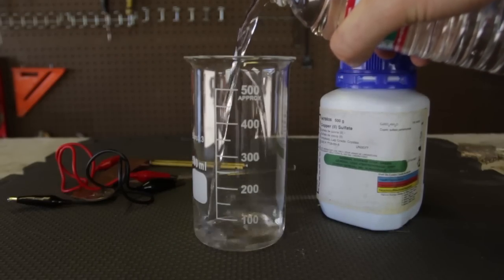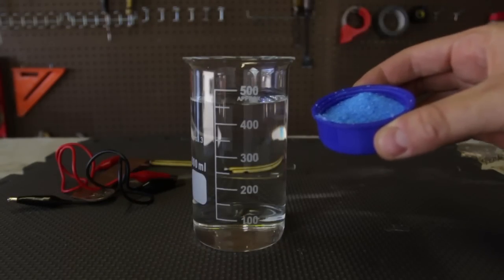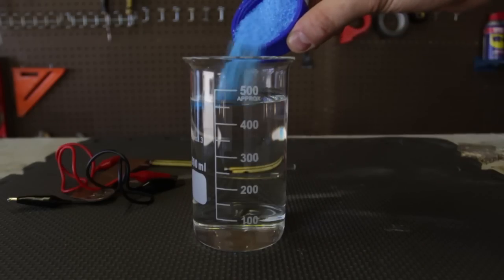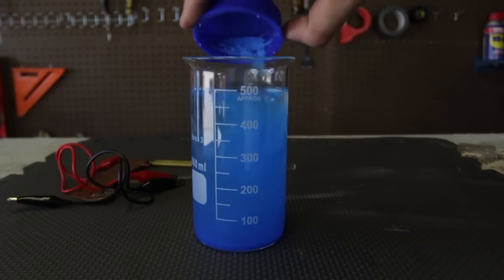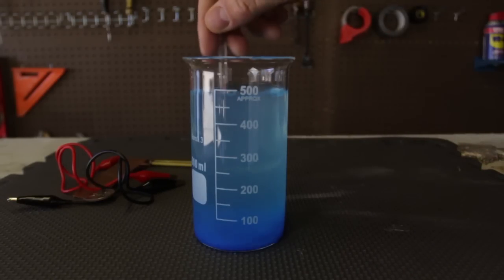First thing we're going to do is fill up the beaker with distilled water. Then we're going to get copper sulfate and pour it inside the distilled water. Then I got a stirring rod and I'm gonna mix it all up and wait till it all dissolves.